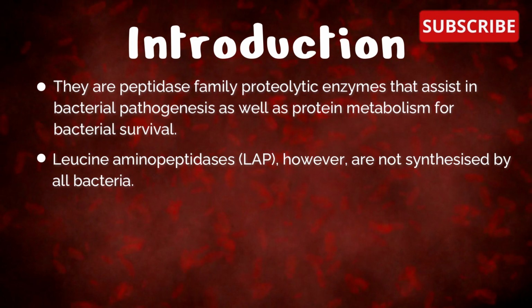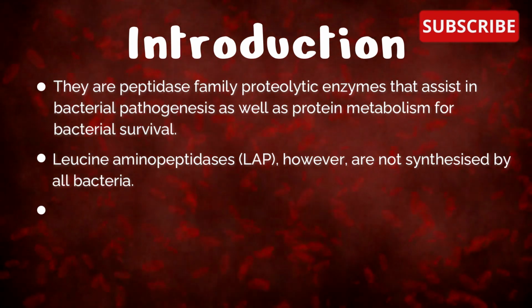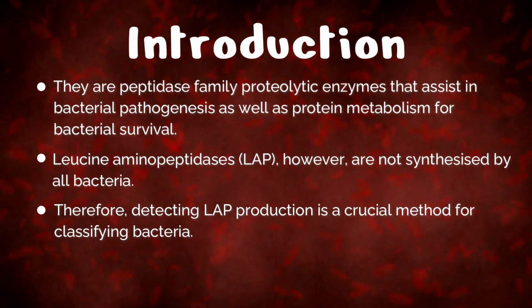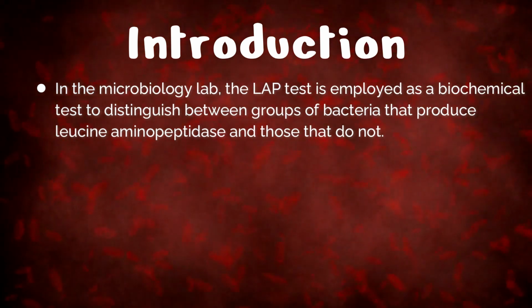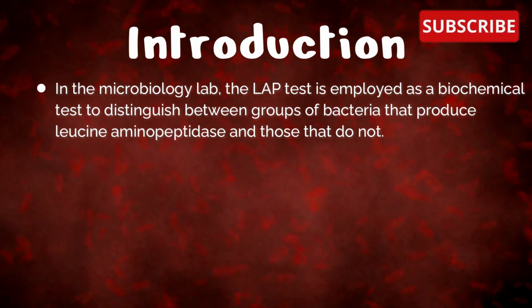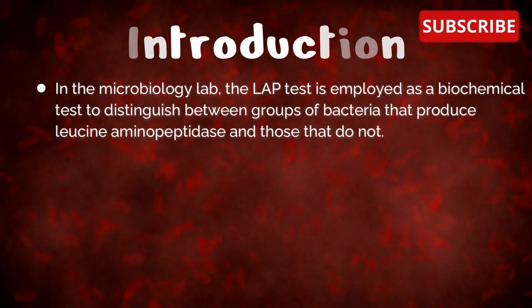Leucine aminopeptidases, however, are not synthesized by all bacteria. Therefore, detecting leucine aminopeptidase production is a crucial method for classifying bacteria. In the microbiology lab, the test is employed as a biochemical test to distinguish between groups of bacteria that produce leucine aminopeptidase and those that do not.